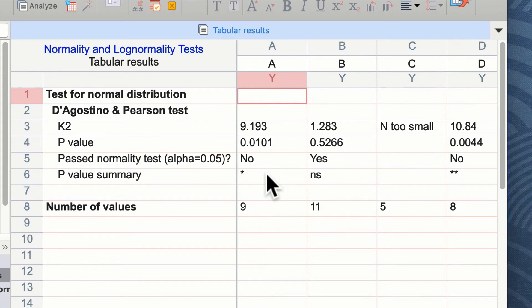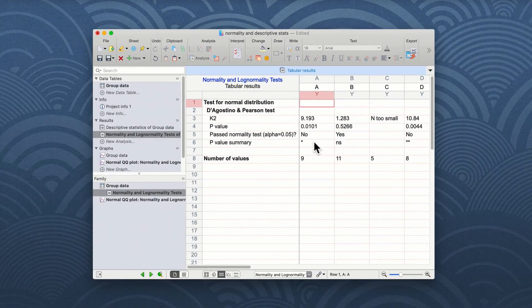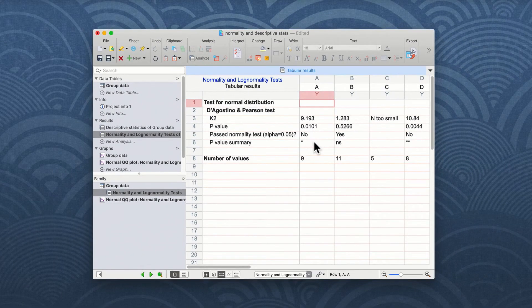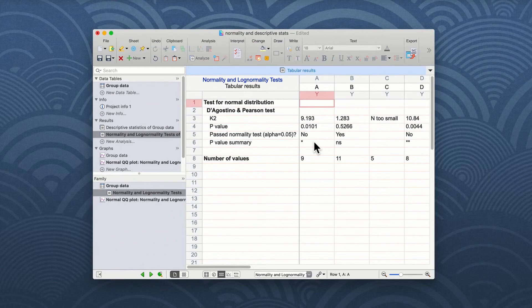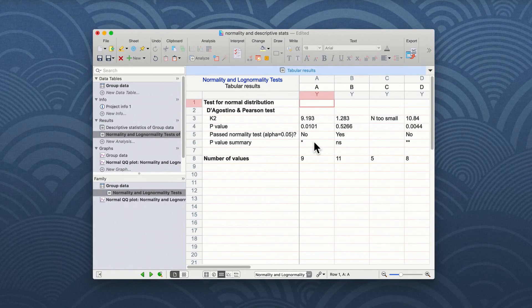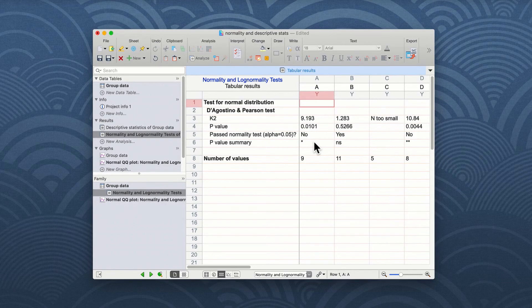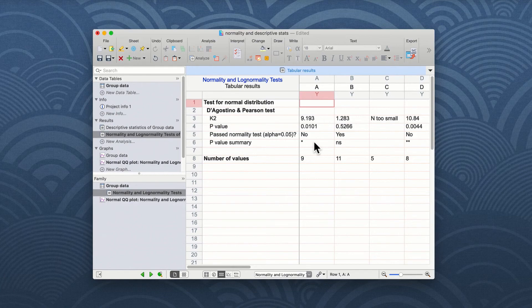So in general, we can find out some very interesting information about our data sets without doing any statistical tests, just simply by using the descriptive statistics to show means, standard deviations, and confidence intervals, and using a normality and lognormality test to check your data for normal distribution prior to doing any statistical analyses of your data.